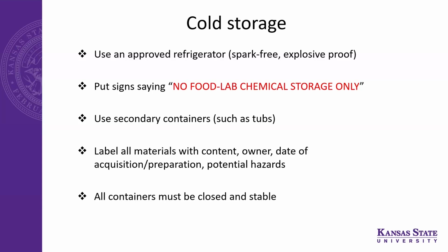Still, the labeling matters. Label all materials with content, owner, date of acquisition, preparation, and potential hazards. All containers must be closed and stable. Everything which applies to storing applies to cold storage as well.